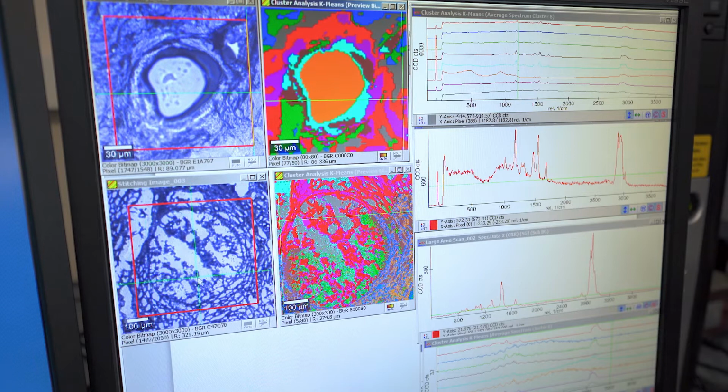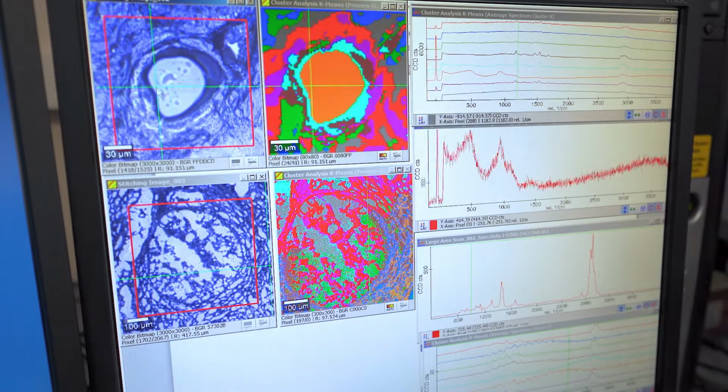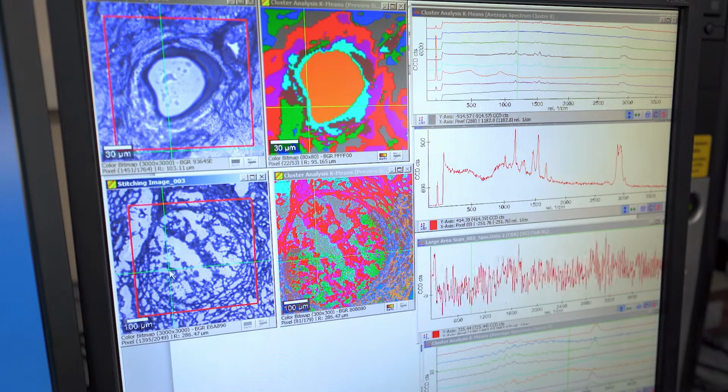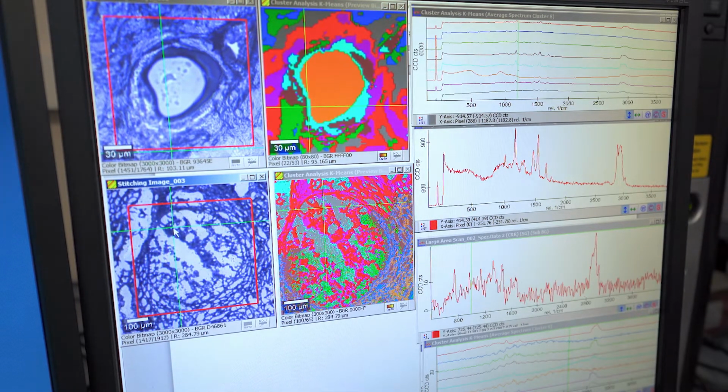And here we have a video image and Raman spectra for a cancer human duct. Using this system, we can also obtain information about the localization of biochemical components. Using this system, we can also perform atomic force microscopy and scanning near-field optical microscopy analysis without sample transfer.